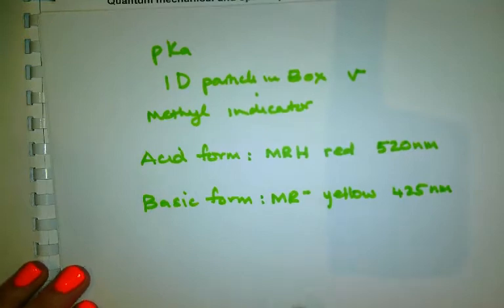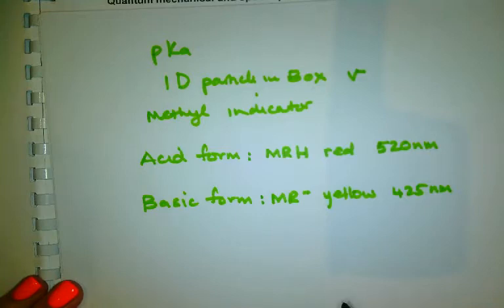In this experiment you are going to prepare a number of solutions. To save yourself some time, do the calculations at home beforehand and just check your calculations with your demi, because you're going to prepare a lot of solutions. If you do your calculations incorrectly, you are going to have to repeat the preparation of the solutions, and this will waste a lot of time. In addition to that, you have to work analytically. Every drop counts. So use pipettes and volumetric flasks to prepare these solutions.